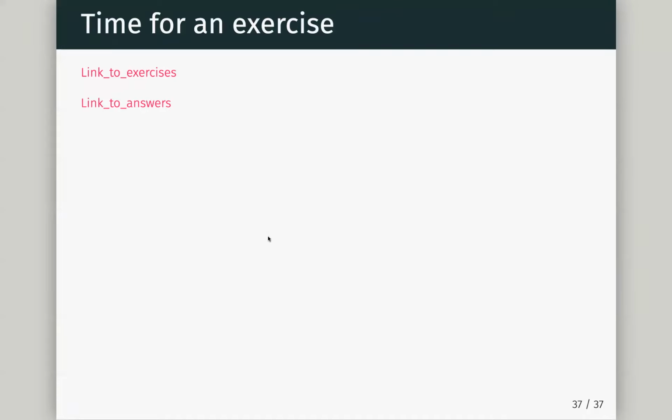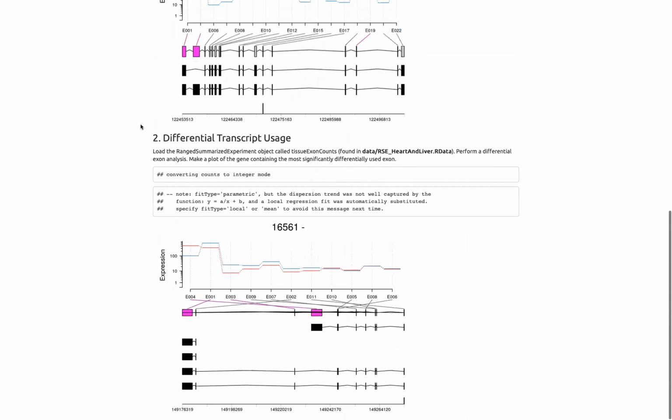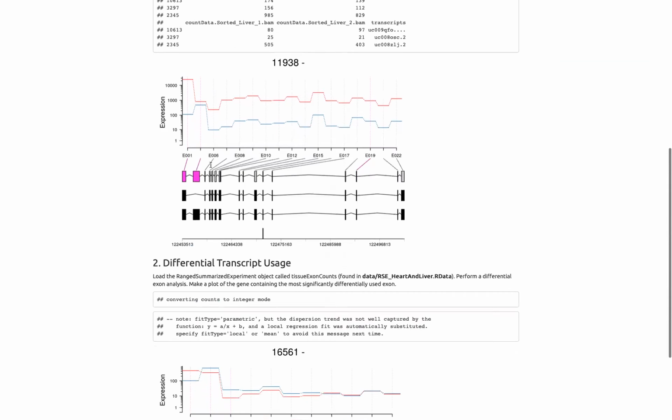That's everything we're going to cover in terms of RNA-seq. I think we've done pretty well for time. We have some exercises here, and they're super simple. The reason they're super simple, I think you're basically just going to load in the results, is because DEXseq takes a long time. Even within an hour, you're going to struggle to get this finished. So I'm just giving you some results to look at and review here.